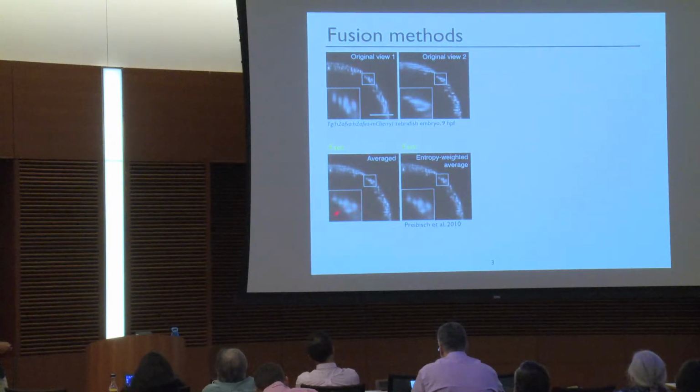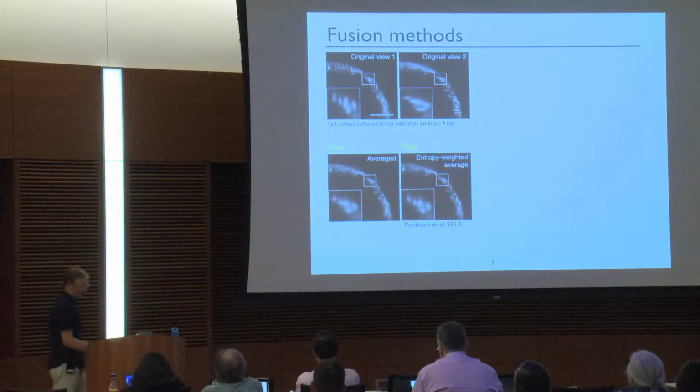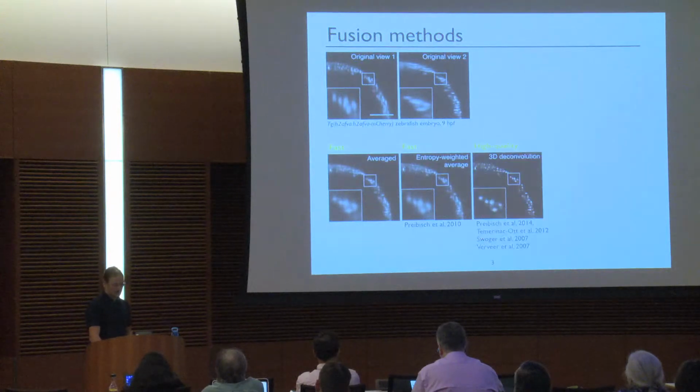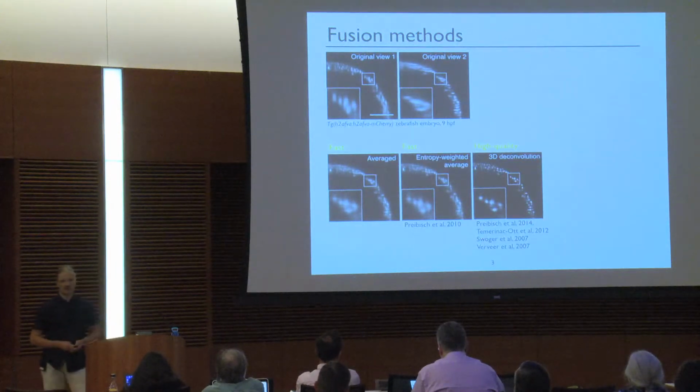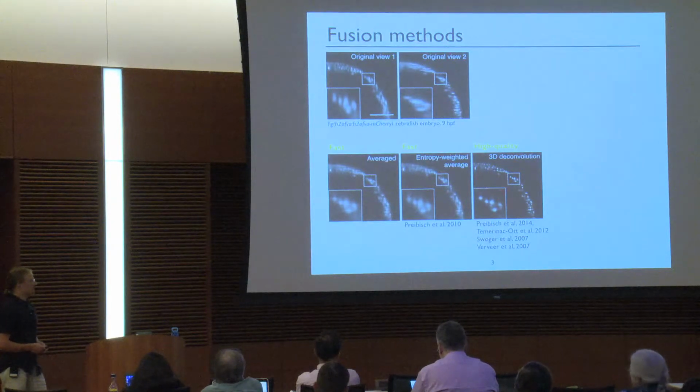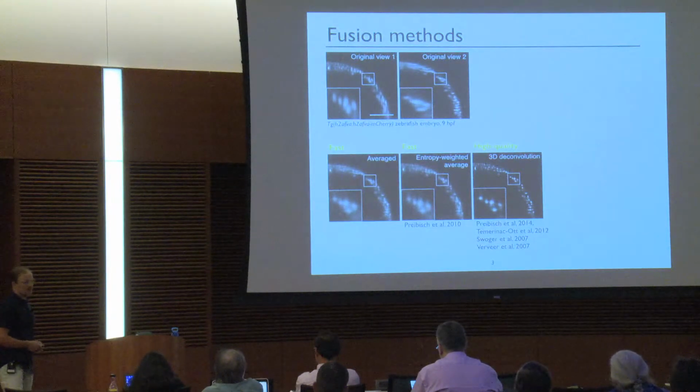So basically, now you don't have blur in just one direction, but in as many directions as you have views. So you don't really improve it. If you want to get high quality results, you need to do some kind of multi-view deconvolution. The quality you get is much better than what we had before. But the downside to it is that it also takes incredibly long.